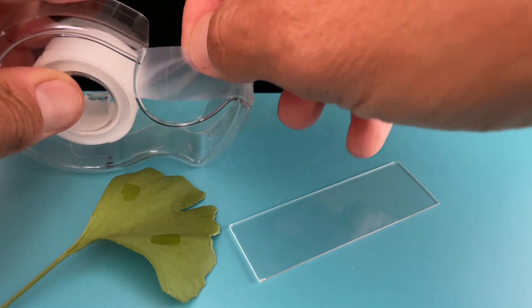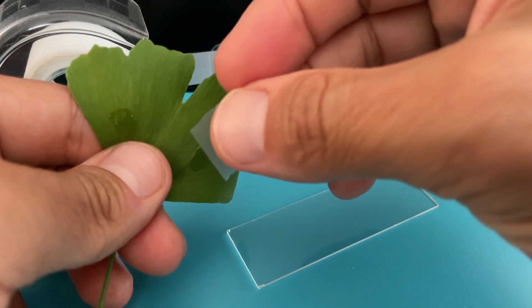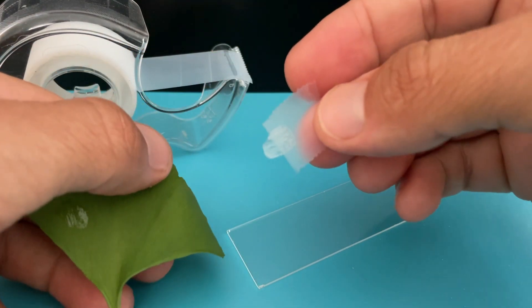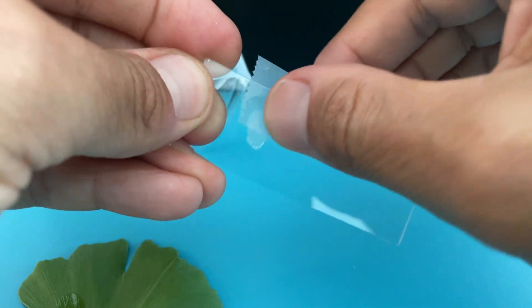I let the nail polish dry for a few hours and now I am going to gently remove it using a piece of tape. Alright, so that's one right there.